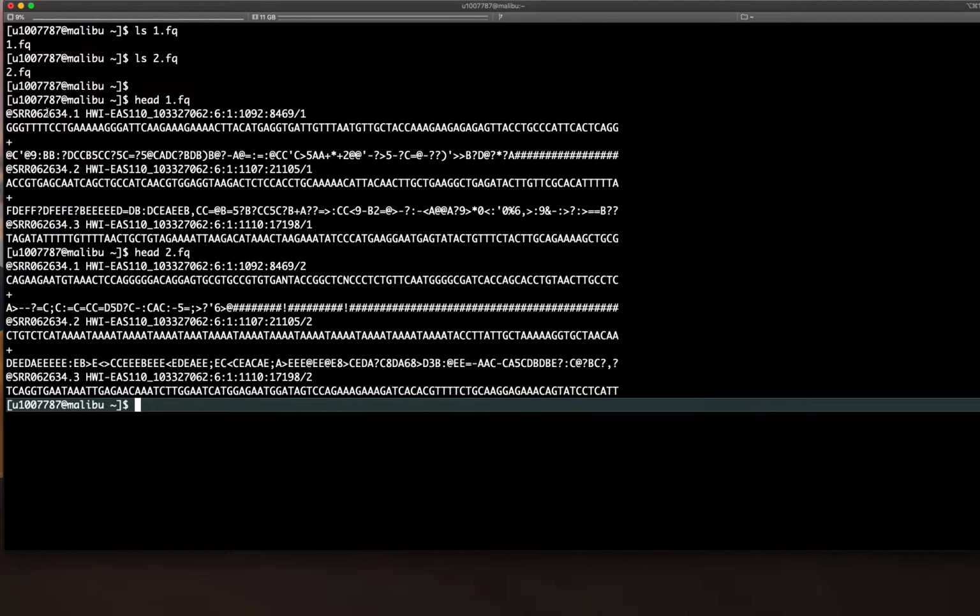Okay, so now on to the meat of the lecture today. There are a lot of different sequence alignment tools out there, and they're broadly broken up into two categories: sequence alignment algorithms for DNA sequences and sequence alignment algorithms for RNA sequences. Now that's a bit of a misnomer because with Illumina, we don't actually sequence RNA. We take RNA and convert it to cDNA first. But these aligners are customized to know that cDNA is usually from a mature RNA that has splicing junctions removed, so you've got exons abutting the next exons and so on.